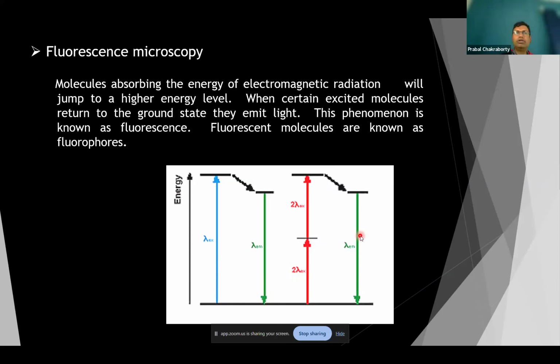If you go into little more detail on how that light source helps in microscopy excitation, you can see that in normal day-to-day imaging like fluorescence or confocal, we generally use single photon excitation or visible light. But when we talk about multiphoton microscopy, we use two photon excitation, which is lower energy and a longer wavelength range. And why is this important?